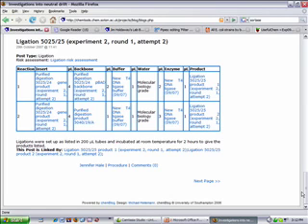Compared to what you first started talking about with getting instrument data, getting spectra of instruments, it seems to me that one of the big problems is the format of how you save that data. There certainly are some older formats like JCAMP, we were talking about this before. Yep. And there have been some attempts at XML-based formats that sometimes have humongous problems when you take a spectrum and put it into that format. Do you have any wisdom about where those things are going? It seems to me like that's a big sticking point at the moment.